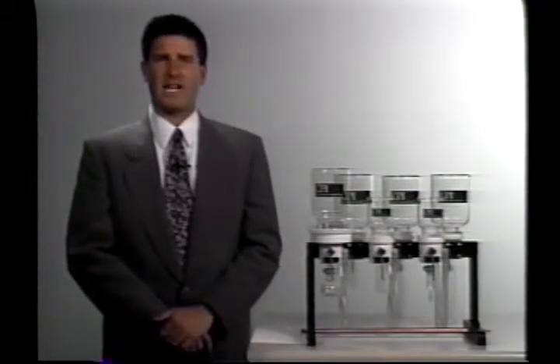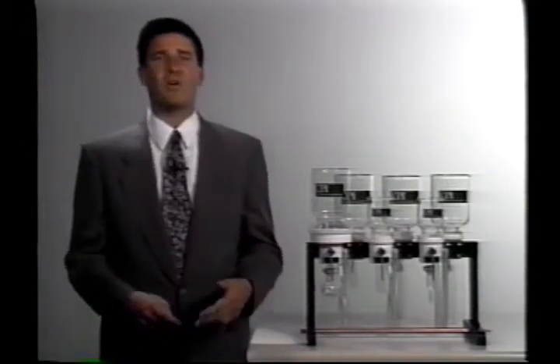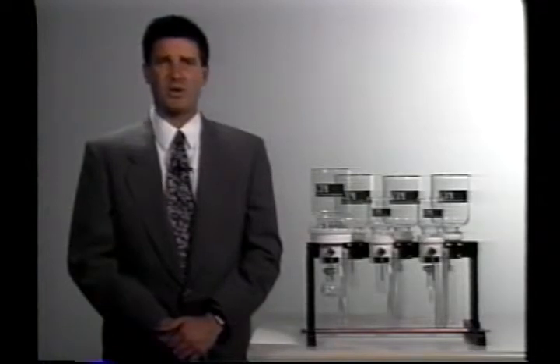CPI has incorporated standard formats for the glassware of the sample reservoir and the collection vessels. We've done this so that you're actually using glass that you probably already have around the laboratory — it's very easily accessible. This will prevent you from having to go out and pay very high prices for customized glassware to replace consumable supplies.